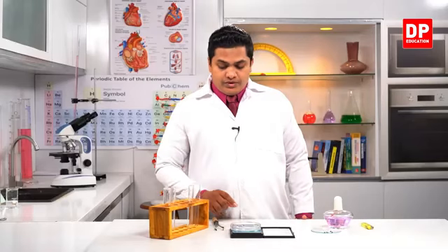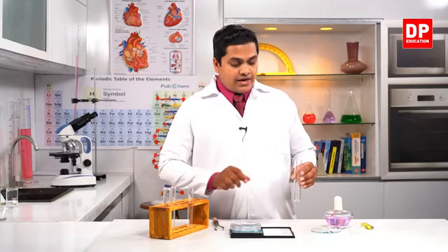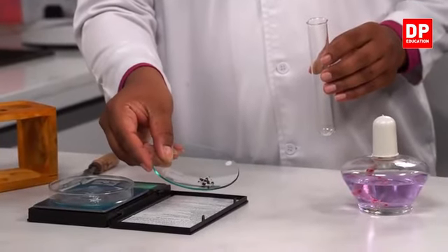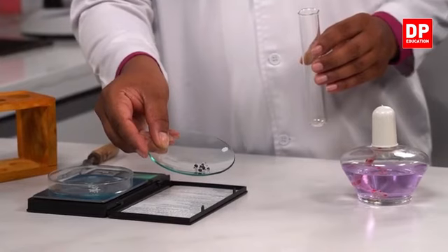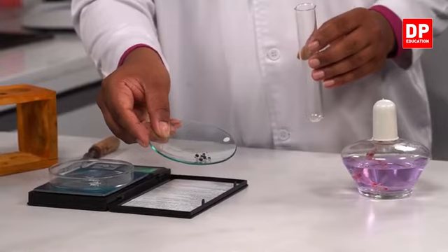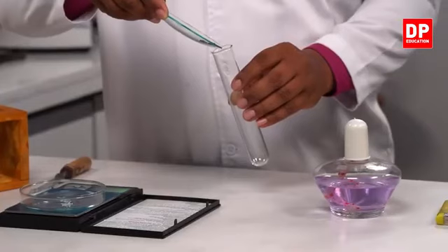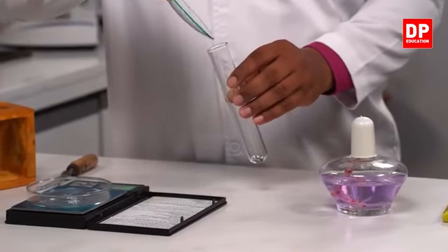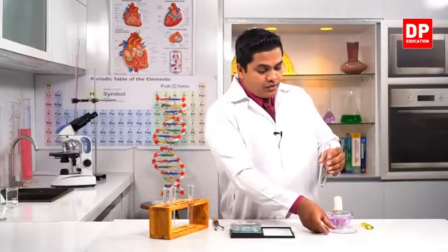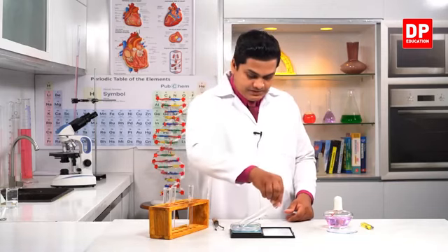So now what I'm going to do is take a boiling tube and insert some, see, these are matchsticks, and I have removed the tail of it and I have only the head of it, the burning part. So now I'm going to put these heads of the matchsticks into the boiling tube. Now I'm going to measure the mass of this system like this.